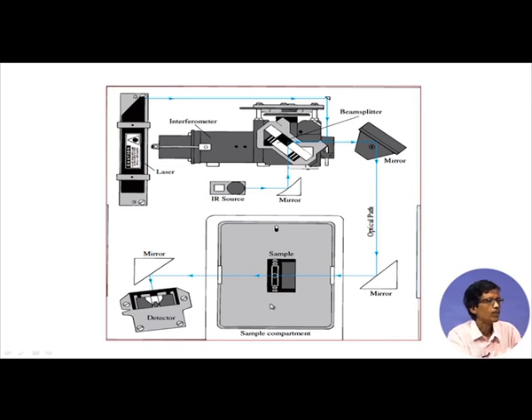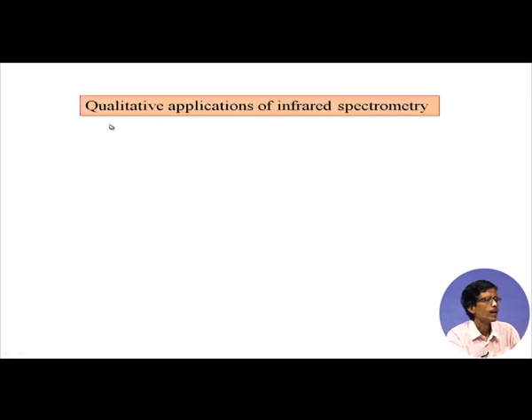So, this particular technique, the IR technique, we can apply for qualitative as well as quantitative analysis.